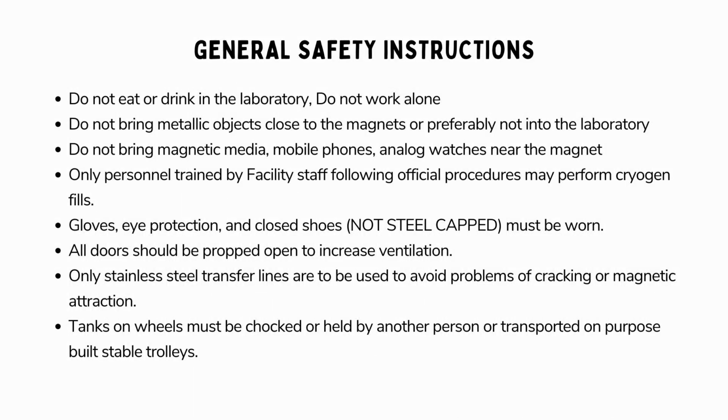General safety instructions for NMR operation. Please refrain from eating or drinking in the laboratory and never work alone. Keep metallic objects away from magnets. It is best not to bring them into the lab at all. Magnetic media, mobile phones, and analog watches must be kept away from the magnet area.